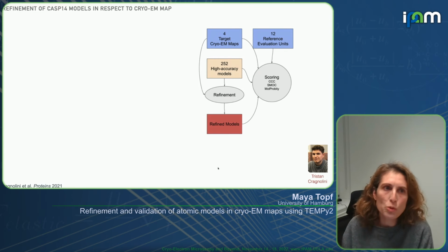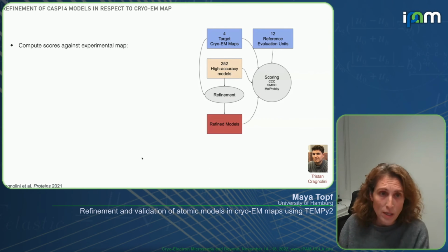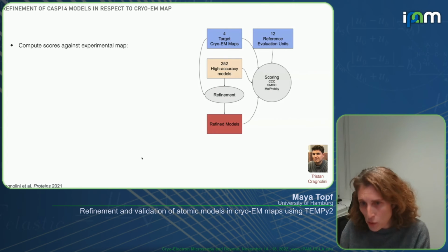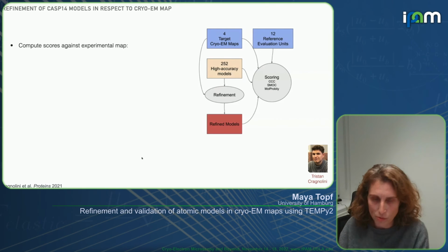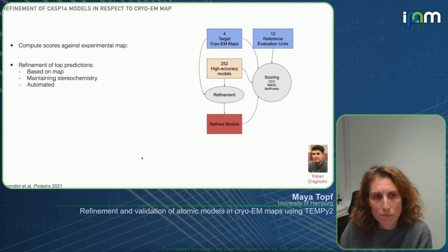But 2 years ago, we refined all the CASP14, the previous CASP cryo-EM targets, and we used TEMPy2 for that, earlier versions of TEMPy2. So we didn't do the ensemble representation back then, but it's the same software.